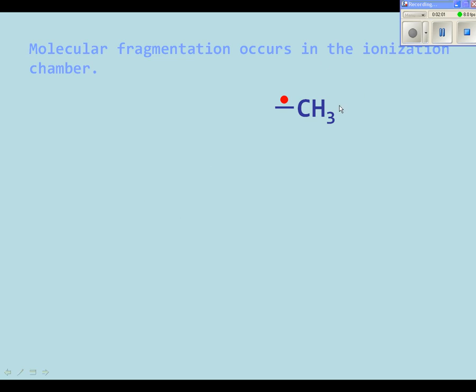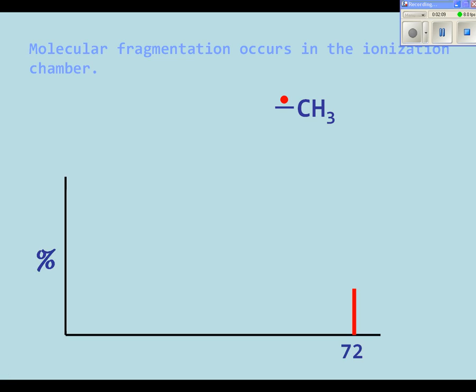The methyl fragment remains behind, and that can be bombarded further and further ionised. So what would happen then would be that when the 57 molecular mass fragment for butyl reaches the detector, we would see a spike occurring at a point on the graph corresponding to a molecular weight of 57. And that spike would represent the butyl ion that has just gone through the mass spectrometer.